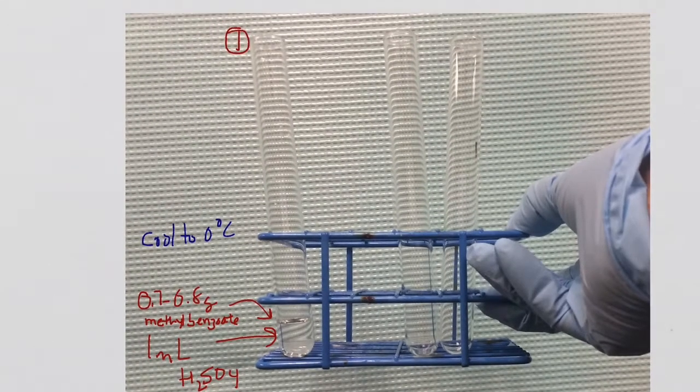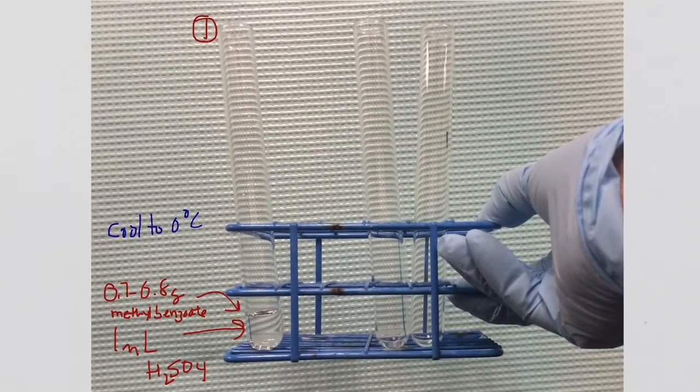So tube 1, we've got our methyl benzoate dissolved in 1 milliliter of H2SO4. Then in tube 2, right here, you're going to have your mixture of 0.4 mLs of nitric acid and 0.4 mLs of H2SO4.